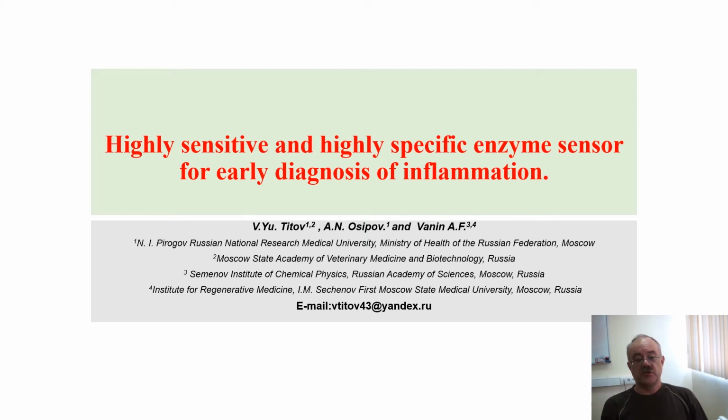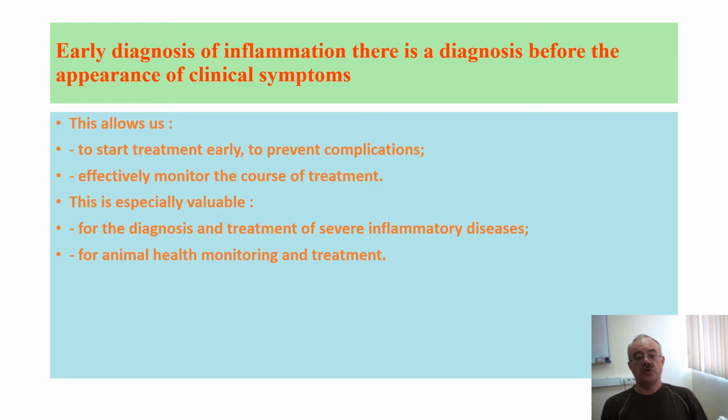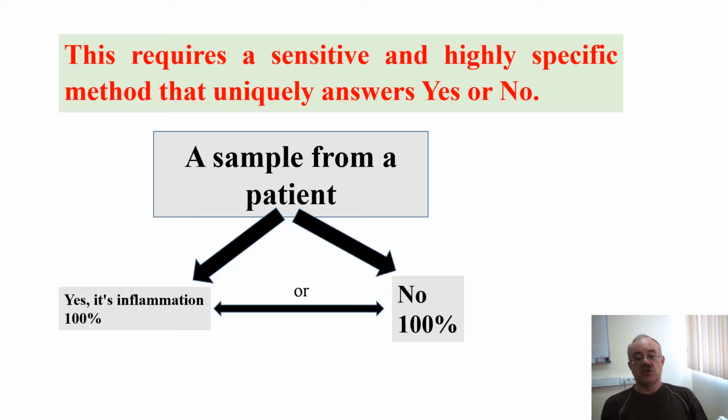Highly sensitive and highly specific enzymic sensor for early diagnosis of inflammation. Early diagnosis of inflammation means diagnosis before the appearance of clinical symptoms. This requires a sensitive and highly specific method that uniquely answers yes or no.